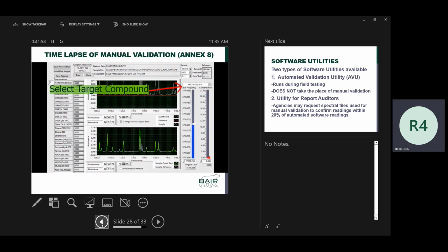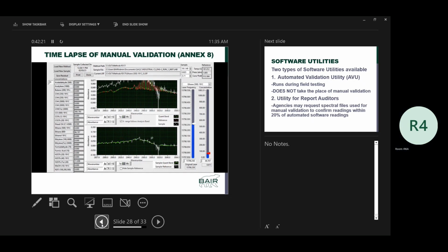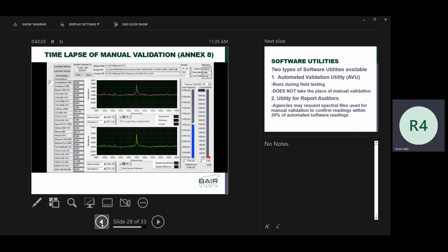And then you literally go compound by compound, and you just click and drag bars over here until you get to an inflection point. So what's going on here? You take it down to the inflection point, and it's showing you over here the peak that's actually being registered, and you're cross comparing that, and you don't even have the numbers of what the blue PPM is. It's good, I guess, but cheap, real cheap.